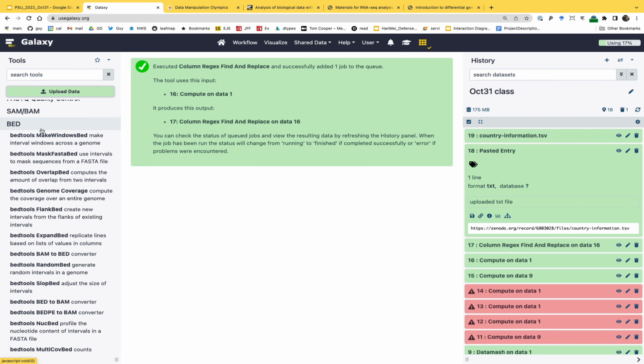It works in most of the cases, but obviously, if you're lucky to study something like sex chromosomes, where you have palindromes, it's like Murphy's Law: your gene will never be there.